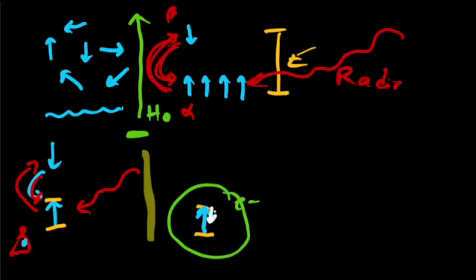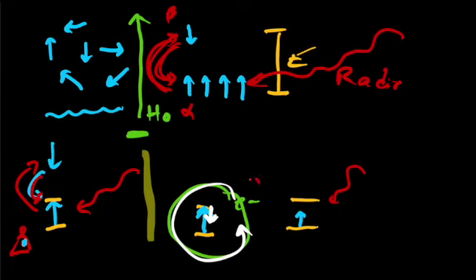So these electrons are going around and around in a circle, in a loop, and they make a tiny little opposing magnetic field. So when that happens, my little magnet for my proton now is smaller than it used to be. And we'll draw my little yellow lines to show that it shrunk a little bit. So that means the radio wave that was coming in, that was trying to flip it, only flips it if it's this size, and now that it's smaller, it stops flipping.